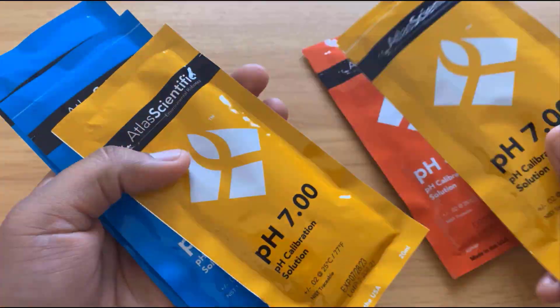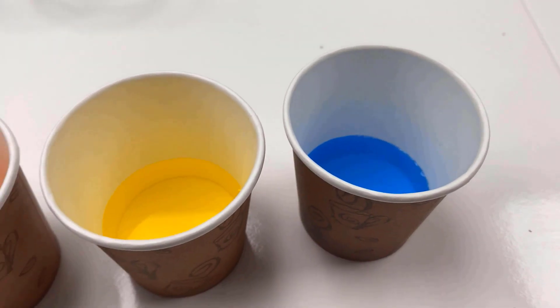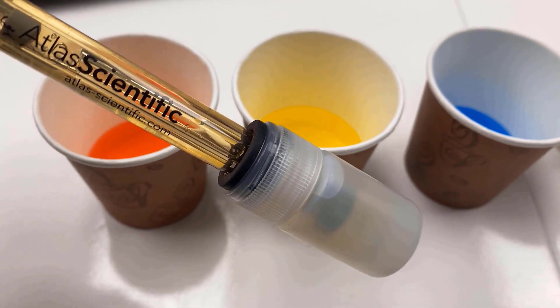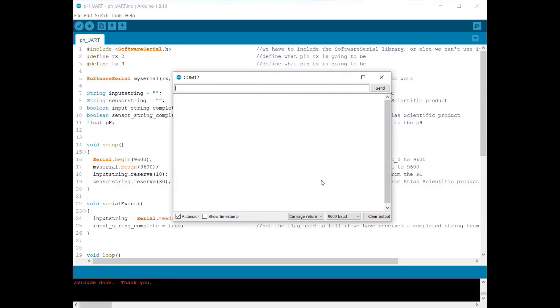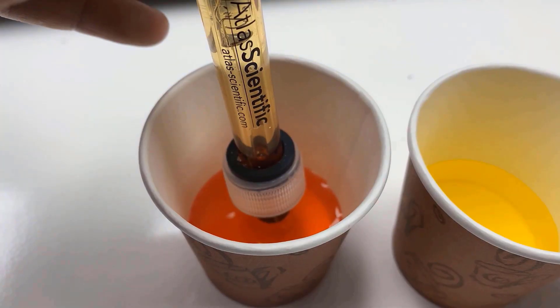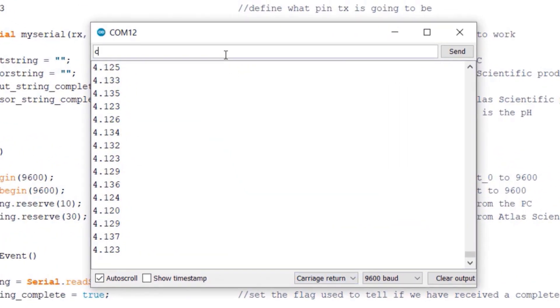Now let's see how we can do the calibration. Here are three pouches of pH solution that come with the sensor kit. Put the solution in three different glasses — the red one is pH 4, the yellow is pH 7, and the blue is pH 10. Remove the sensor cap and put the probe in the standard pH solution. We will use the UART mode code for calibration, so upload the UART code and open the serial monitor. Put the pH electrode in the pH 4 solution and wait for the readings to stabilize — it took 5 minutes for me. Then type 'Cal,low,4' and hit send — the sensor is now calibrated for pH 4.